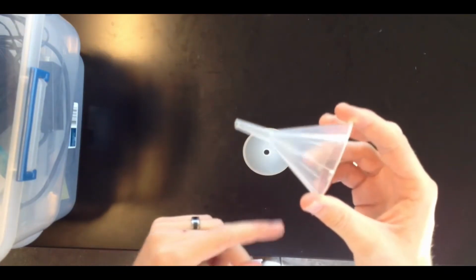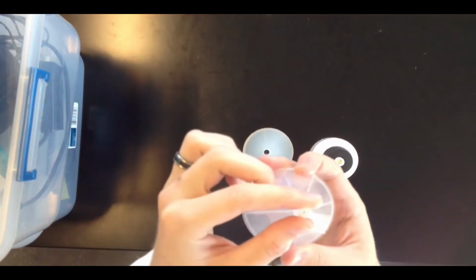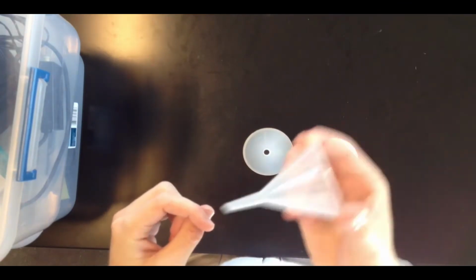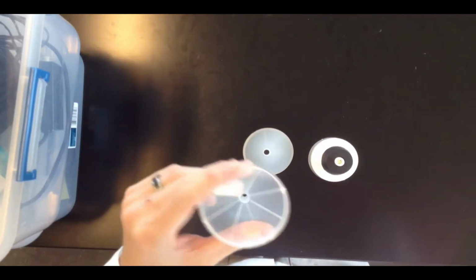So the first looks kind of like a garden variety funnel, but the thing to note about this particular type of funnel is that it has a relatively small opening on the bottom. This is a relatively thin opening that's not going to allow solids to pass through unimpeded. So if you try to use this funnel to transfer solids, you're going to get clogging, and things are going to get messy, and it's going to be bad.